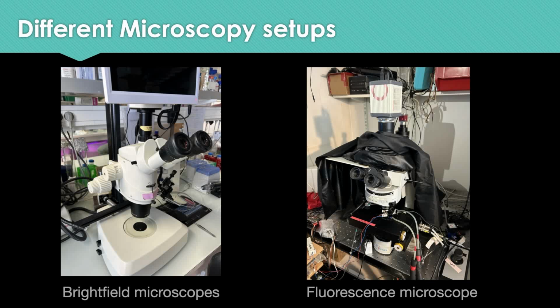Although specific components of the sample cannot be observed with it and the resolution with it is limited. Moving on from the bright field, fluorescence microscopy is also quite frequently used, with the key advantage of this microscopy being that we can observe specific parts of the sample and being able to label components individually with it.